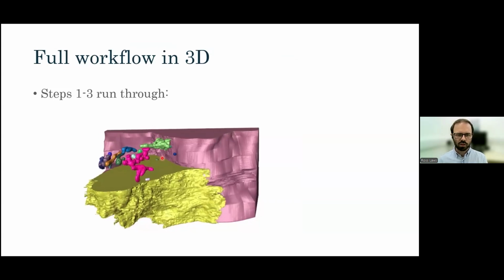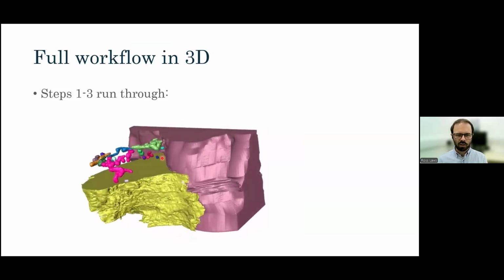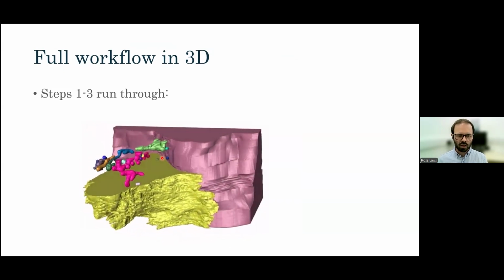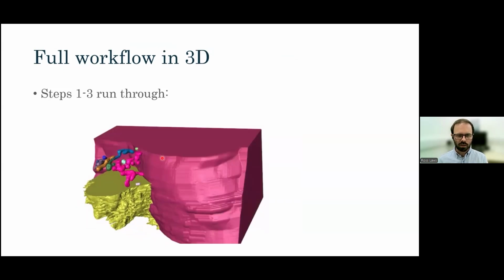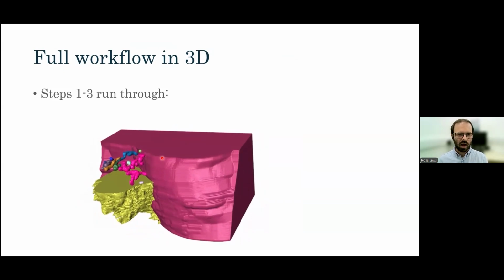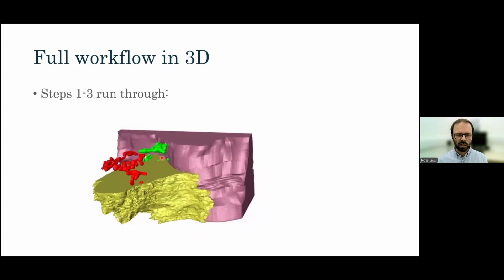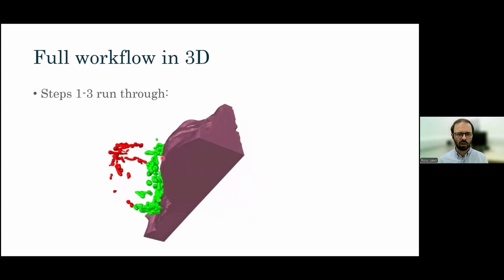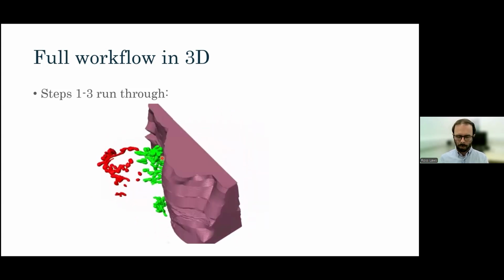So this is the 3D reconstruction. You've got the basement membrane in pink, the mitochondria in multiple colors, and the cell membrane in yellow there. So if I expand the basement membrane to the central point of the cell to that distance, and then use that to co-localize which mitochondria are in the apical and basal half of the cell, then we get rid of that and the cell membrane, and what we're left with is the two populations of mitochondria divided up for us to then analyze.